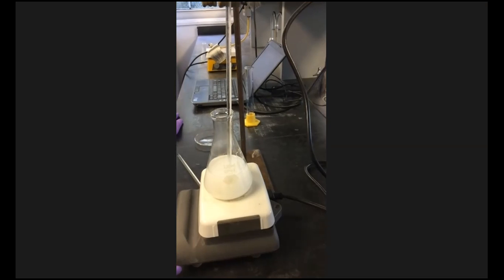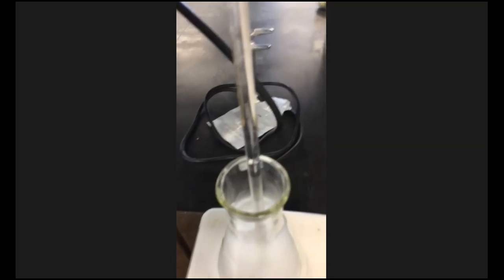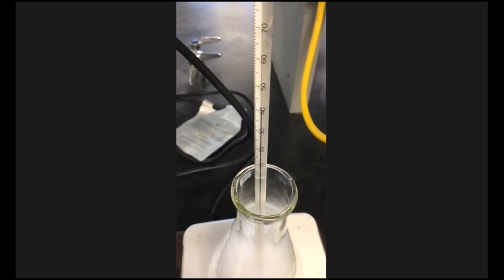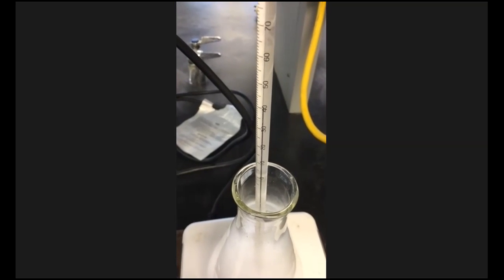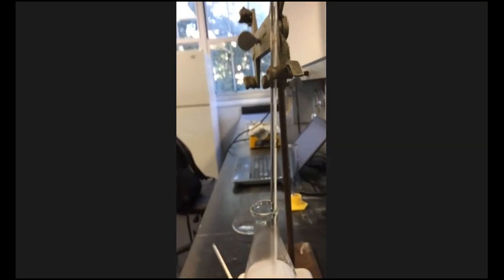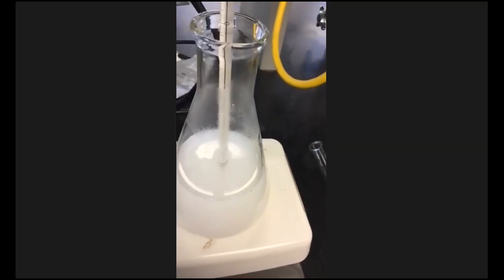All right, so right now we are at, and hopefully you can read this thermometer. You can see the mercury going up in it. Right now we're at about 42 degrees Celsius. So that's good. And you can see the water starting to condense on the side of the flask, right?